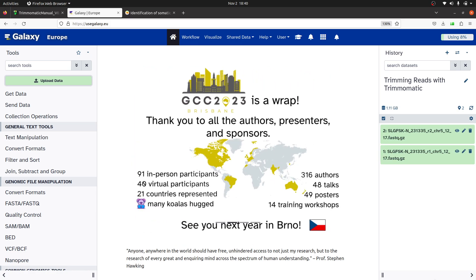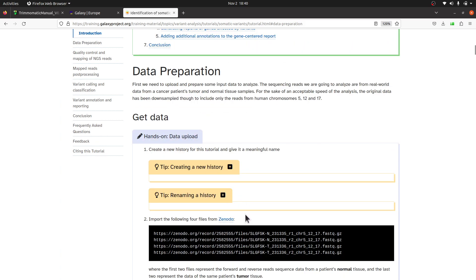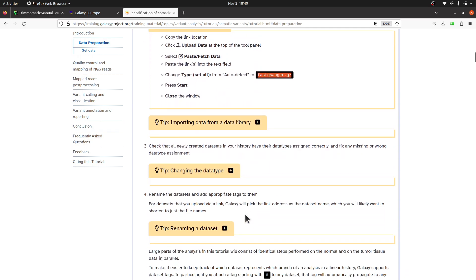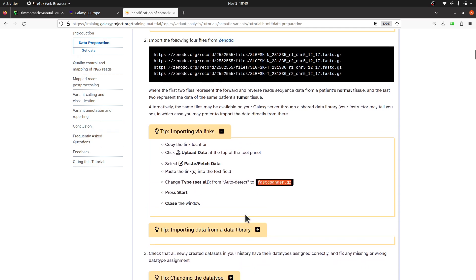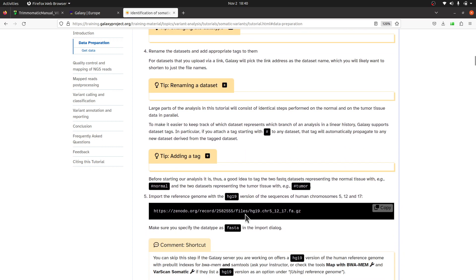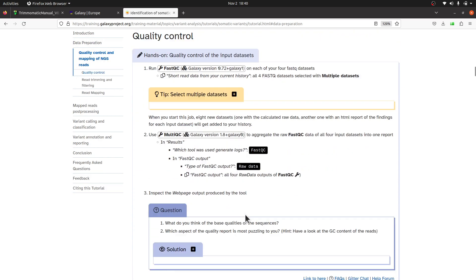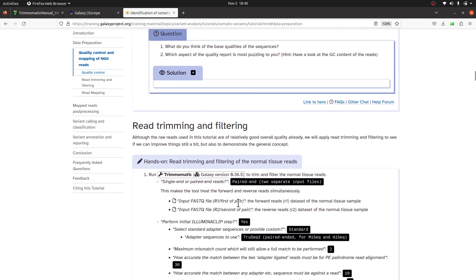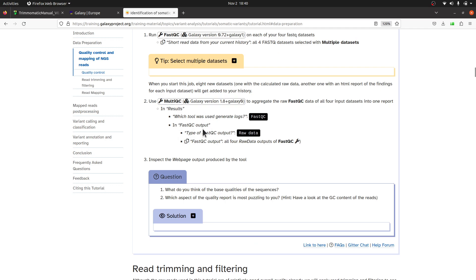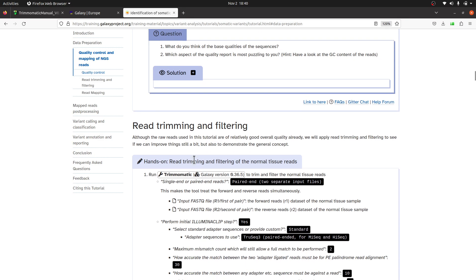The files have been imported, so we can proceed. Now, if you have your FASTQ files or reads, it is important that you perform quality control — that's very important. But for this tutorial we are going to skip the quality control; the focus is to show you how to perform the trimming. If you have your own data, always do quality control first, then do the trimming.